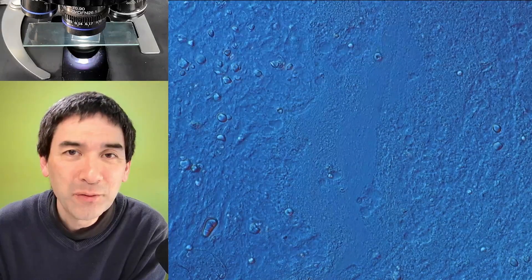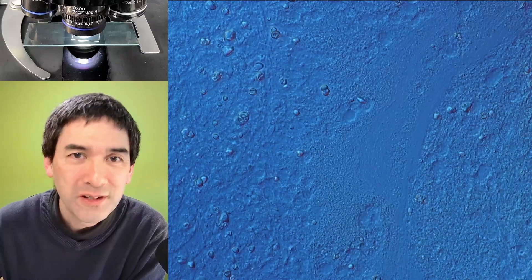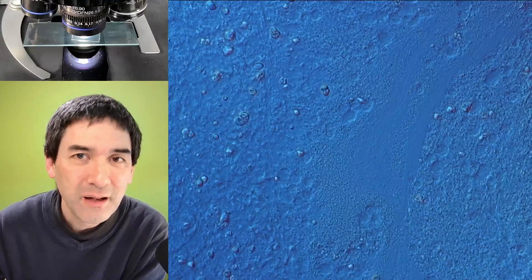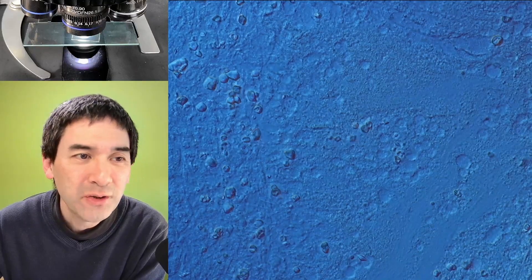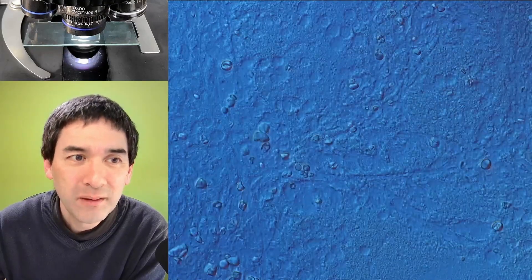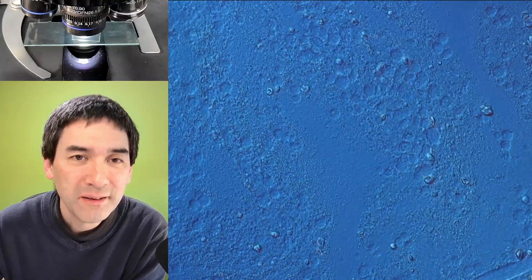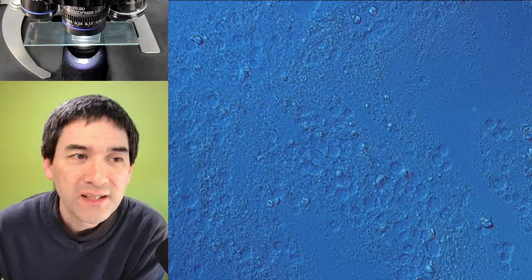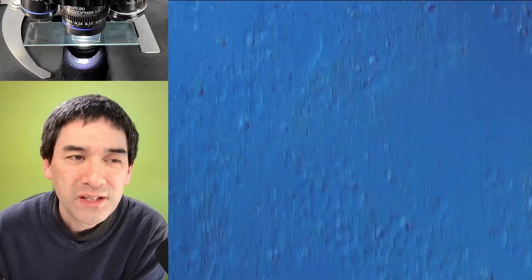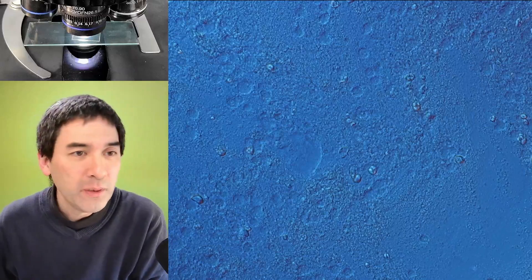This is one of the reasons why slime molds are a little bit unique. They are not molds, they're not fungi — they are basically amoeboid cells that fused together into a gigantic mass, a blob so to say. And essentially what we're seeing here, those round structures, are individual cell organelles, but we do not see separate cells. That's something I quickly wanted to show you.